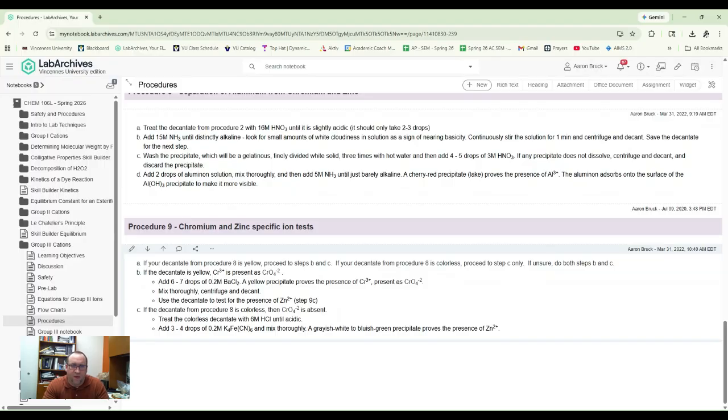associated with them that we don't have to worry about, okay, first I need to take this and completely separate it, then characterize it, and then take this next one and completely separate it and characterize it. Once I've got those 2 subgroups established, for the first subgroup, the manganese containing subgroup, that one is straightforward, bang, bang, bang, bang, bang, you go through. And then for the zinc and aluminum subgroup, you have to separate the aluminum from the rest, but then you can test the aluminum on its own, and the chromium and zinc on their own.